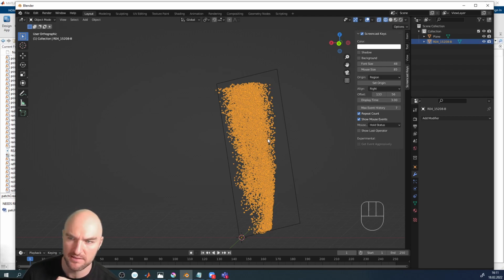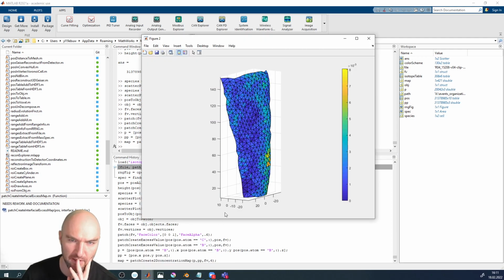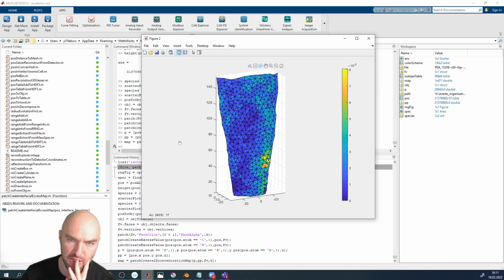You can also access them in Blender and essentially say, give that color to my object. And this is great for visualization, of course. Okay, but I've got to check on why this is not working. But anyway, the point is you've got color information in there, and here we've got the concentration information.